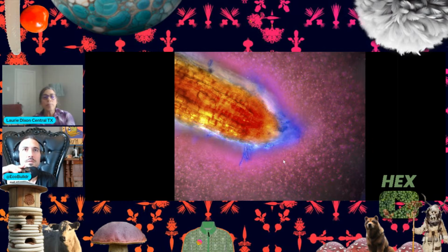So with microscopy, the technique we use is called shadowing. And shadowing just allows these microorganisms to pop. It's just using the microscope in a certain way that you can see the bacteria. But there's also a module that you can put on the microscope called an epifluorescent module. It allows you to see the cyan blue wavelength.